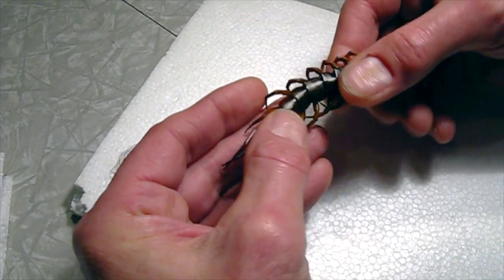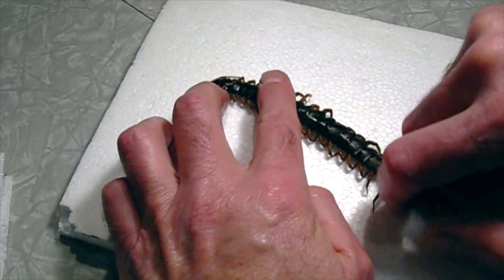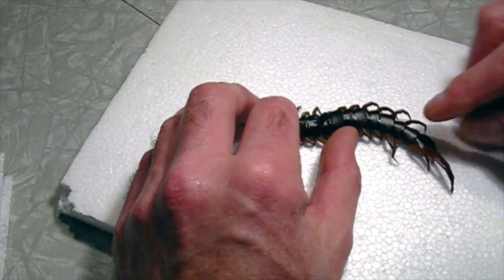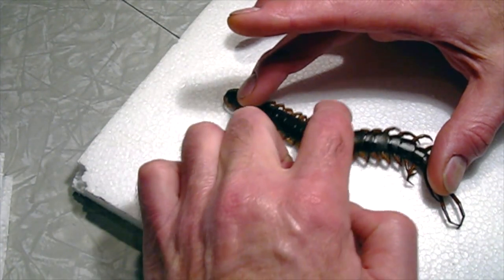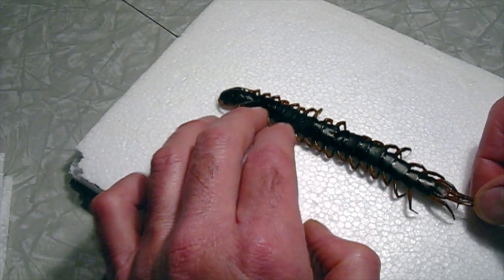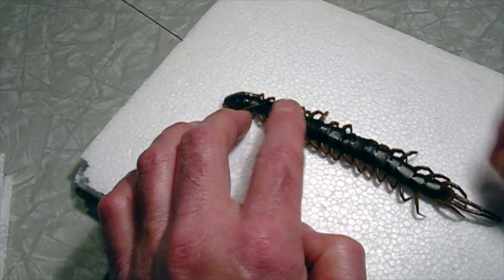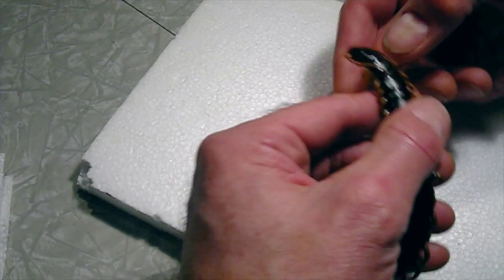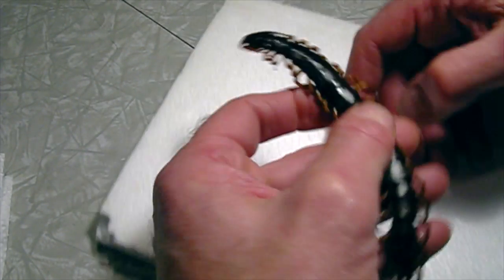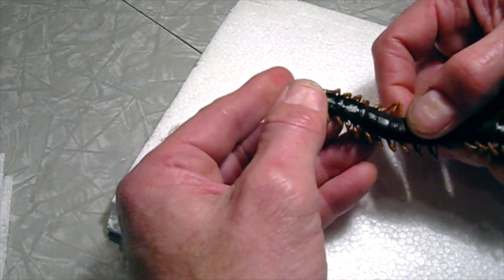You can pin these just straight up like this. I sometimes pin them in kind of an S curve, just to make them a little more dynamic. But I think I'm going to pin this one up just straight. I'm probably going to donate this one to my friend who's starting the insectarium in Portland as a specimen for her display collection.